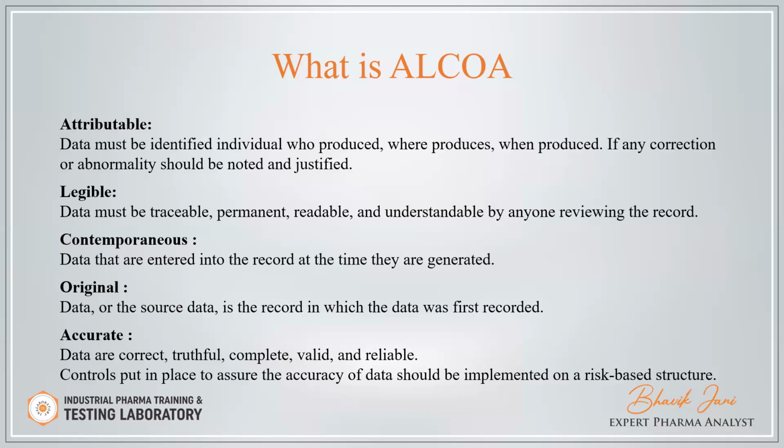If you record the data in your personal diary, then your personal diary will be the original data. That's why CGMP says you have to use the CGMP report issued by the QA for any data capturing. Then the accurate: data are correct, truthful, complete, valid, and reliable.